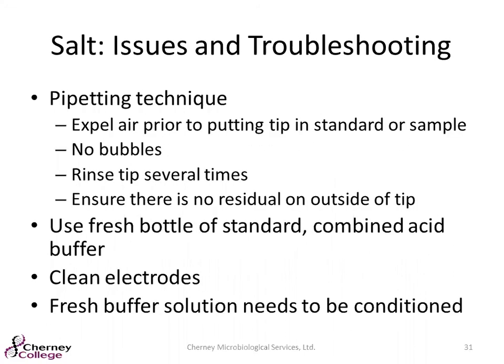Another piece with salt, I can attest to this: the pipetting technique can be extremely difficult to learn because it is so critical to your result. So you want to make sure that you have no bubbles, you rinse your tip several times, and that any little extra droplet can really affect your result.